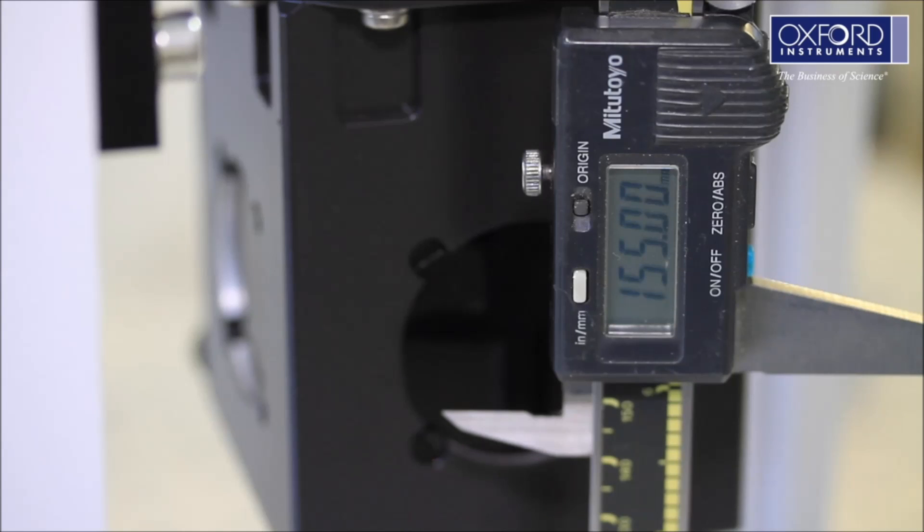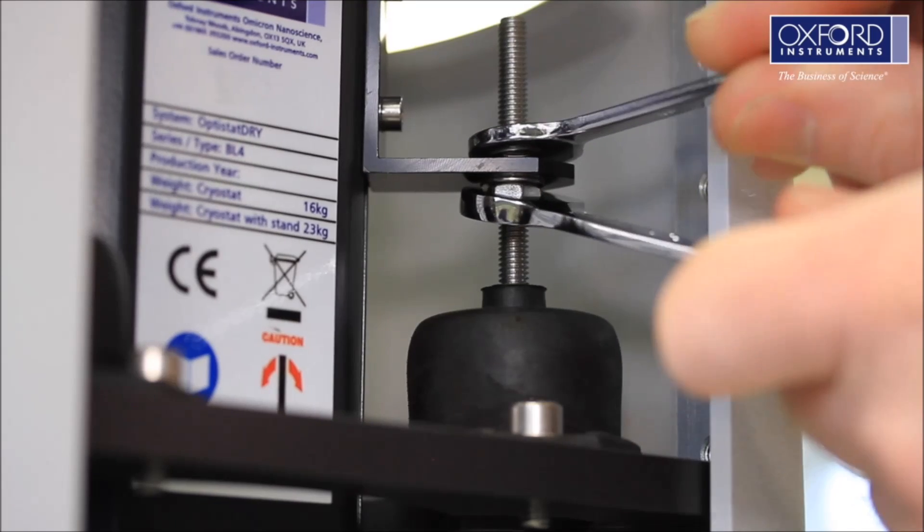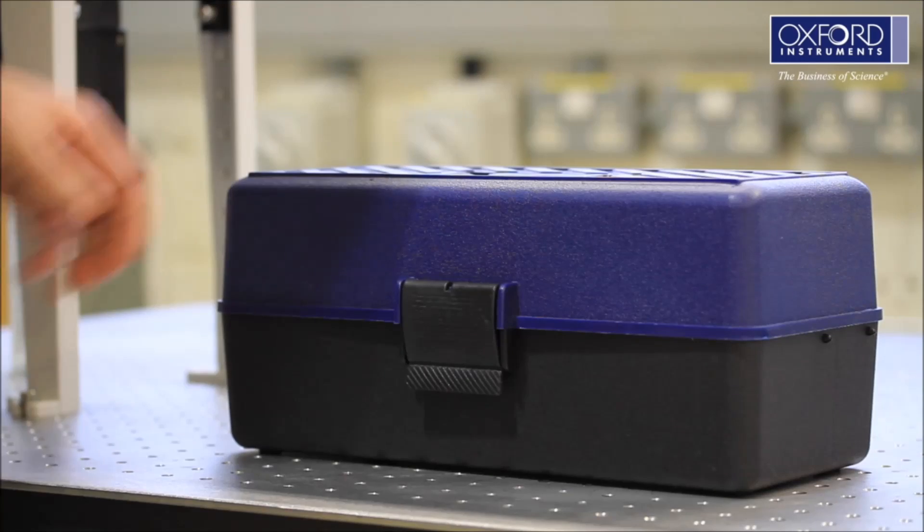When you are happy with the cryostat height, tighten the M6 bolts using the spanners from the optional spares kit.